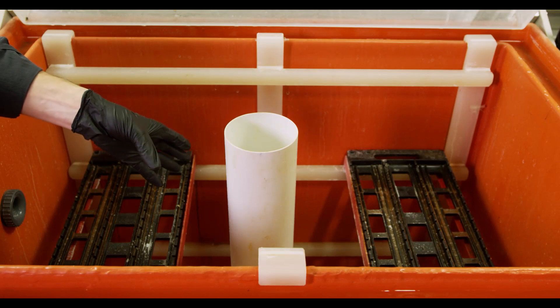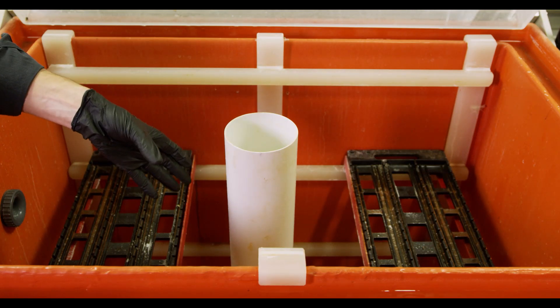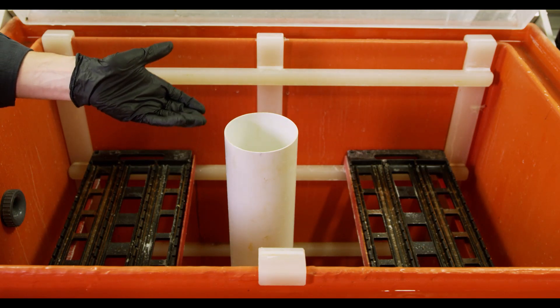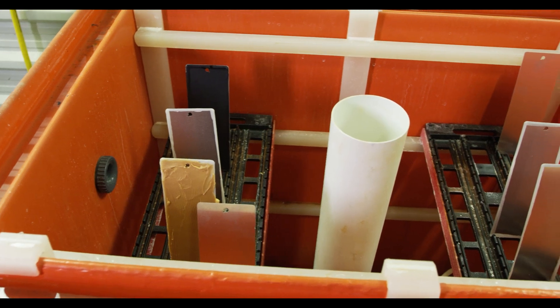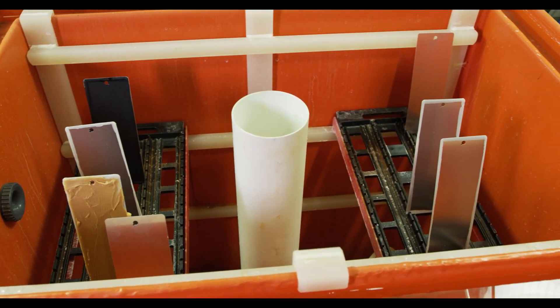In the center of the salt spray cabinet you can see this white cylinder. What this does is actually pumps out a salty mist into the air, and then the goal of this test is to measure or see how long these various samples are going to last before they begin to corrode.